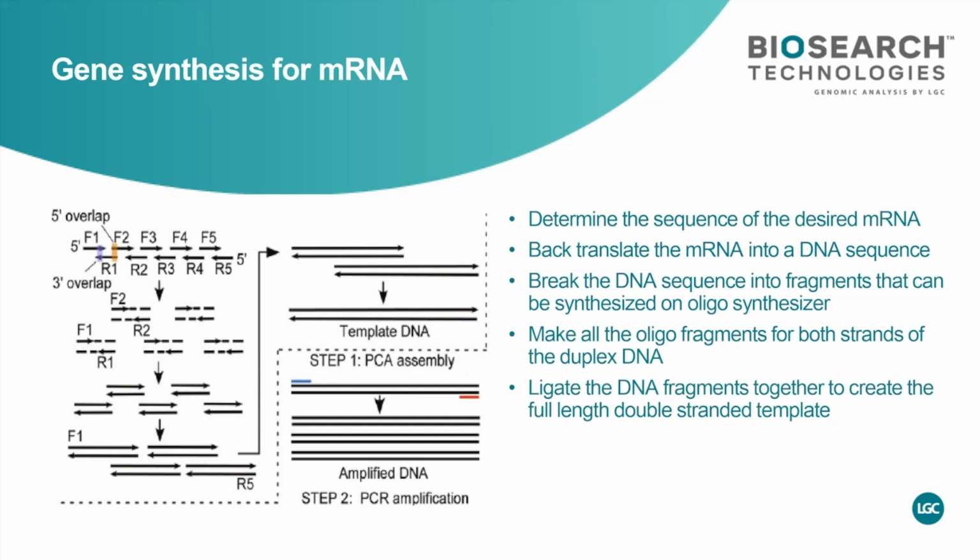After that, you can infect the cells, or you can cut it, put it in a different vector, and infect the cells, and it will start producing the mRNA because the vector would tell it to do so, like a cell machinery. As I say, this is quite an old technique, but it's one of the most relevant right now.